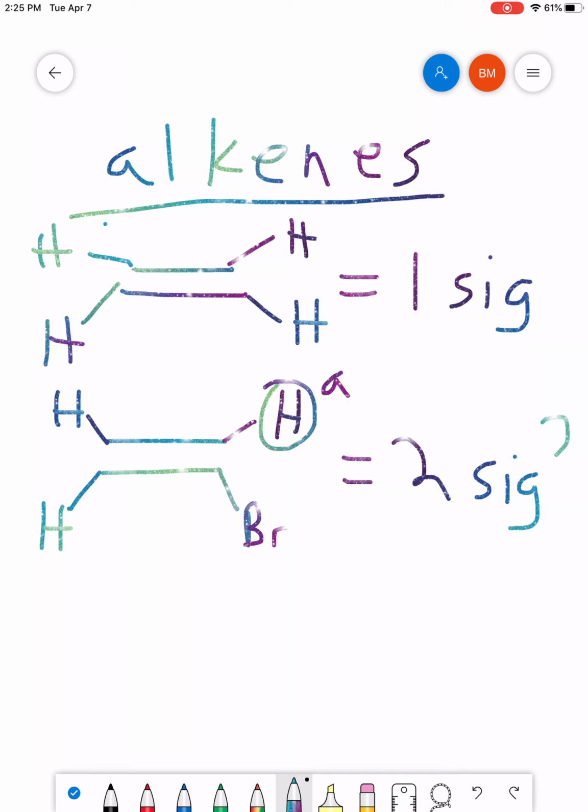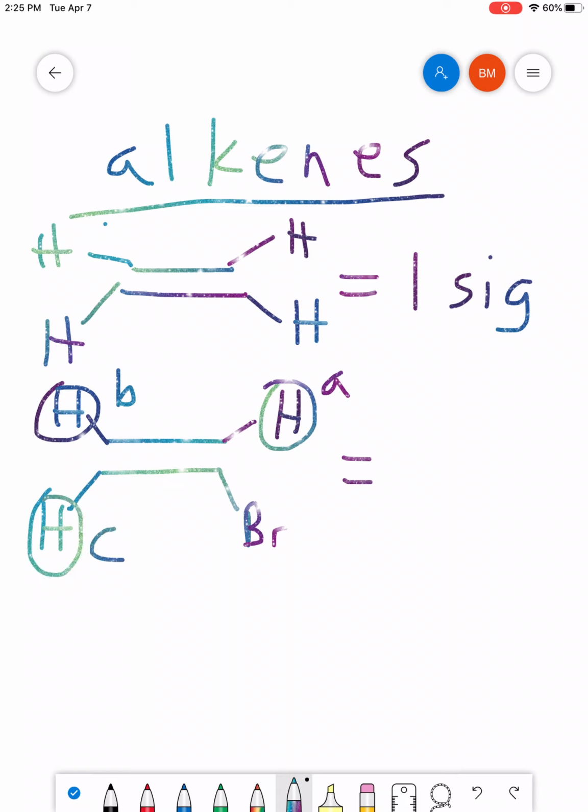But if you did so, you would be wrong. Haha, bazinga. Yeah. This is going to be the first case where you've seen that two H's that are on the same carbon are not necessarily the same type. And in fact, in this case, we can say that definitely this H is individual and unique from this one. So this one would actually give you 3 signals.